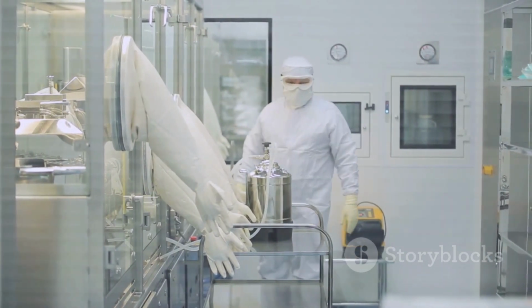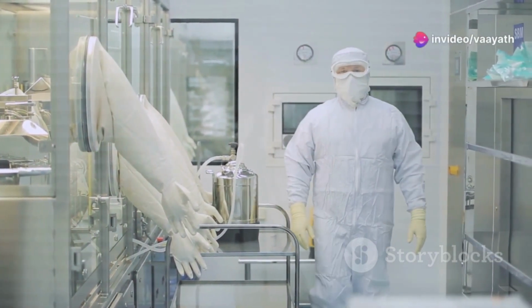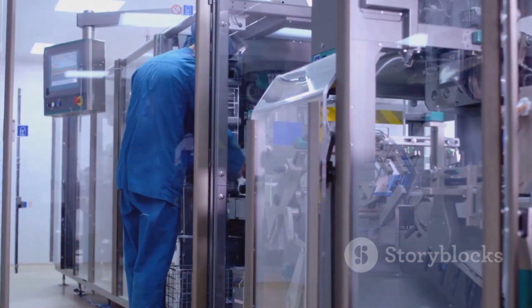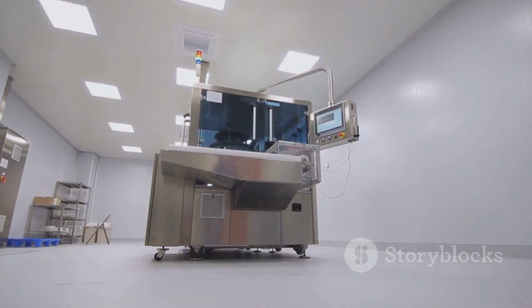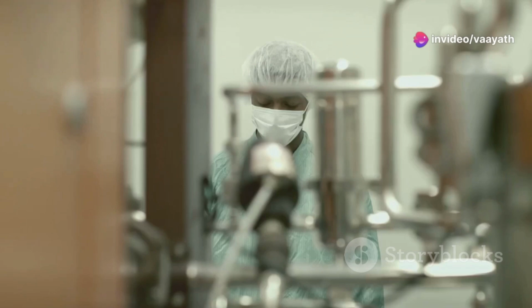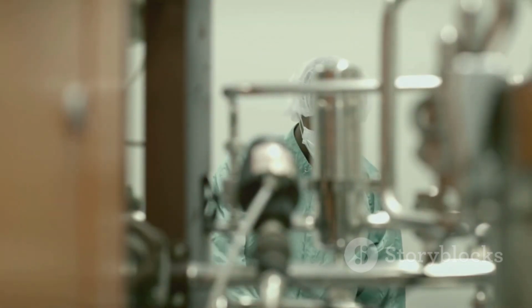Startup media fill, as the name suggests, is performed before a new production line or product is released. It validates the initial sterility of the process. Ongoing media fill is conducted routinely during production, ensuring that sterility is maintained over time. Finally, requalification media fill is triggered by specific events, such as changes in equipment, processes, or personnel. It revalidates the process to ensure that any modifications haven't compromised sterility.